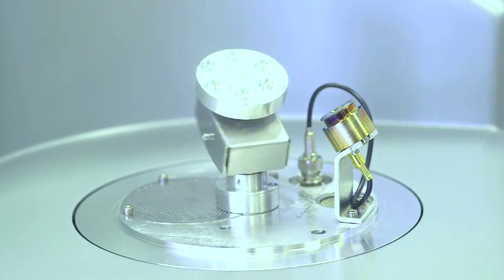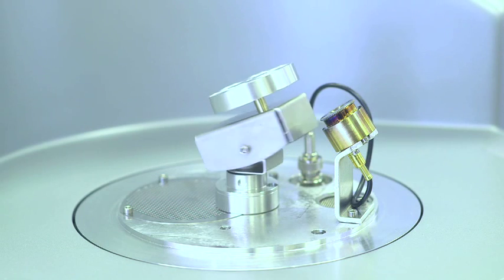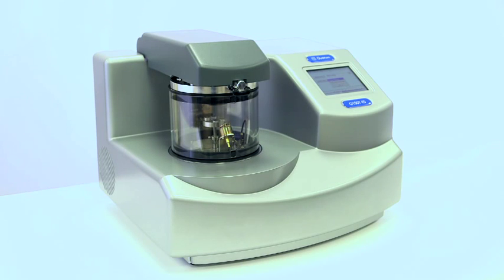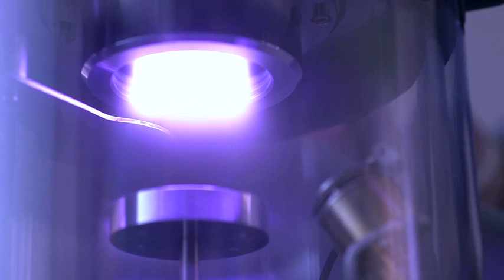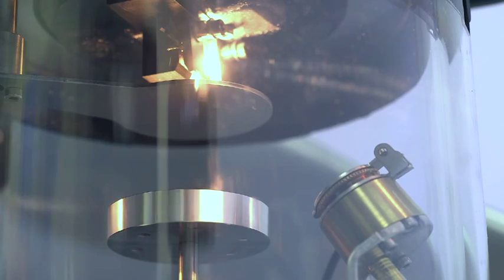For users who do not require the high-resolution coating capability of a turbo pump system, a rotary pump version is available. The Q150R is typically used for sputtering of gold and other noble metals and evaporation of carbon fibre.